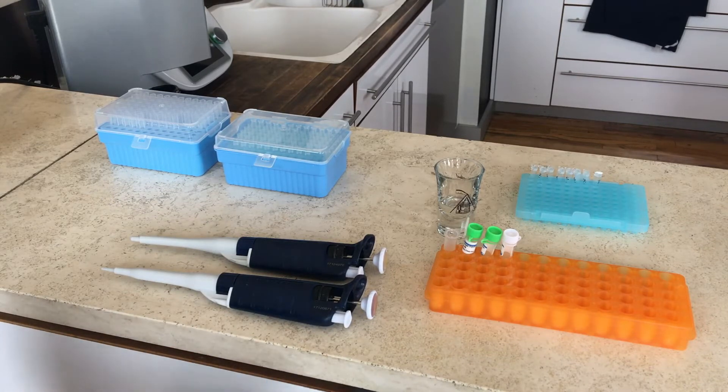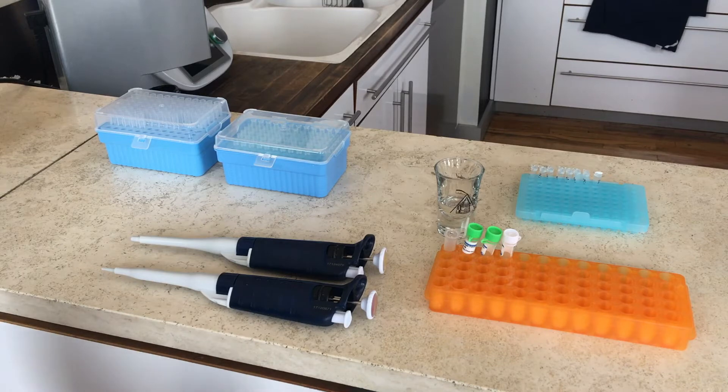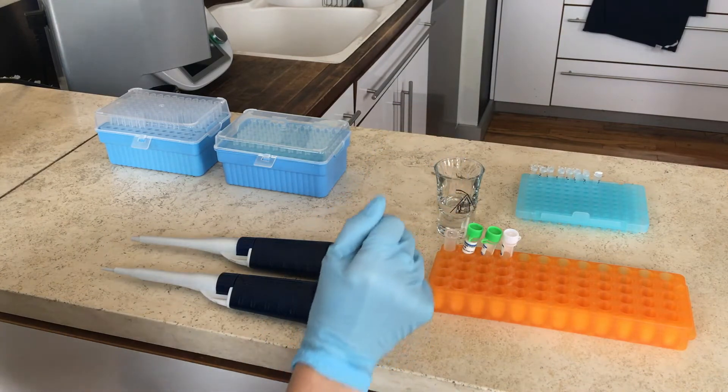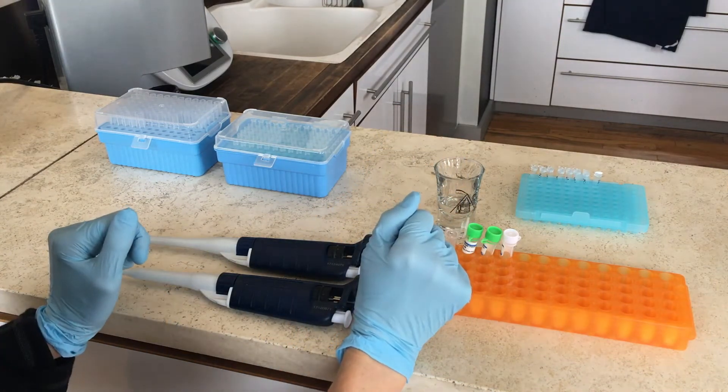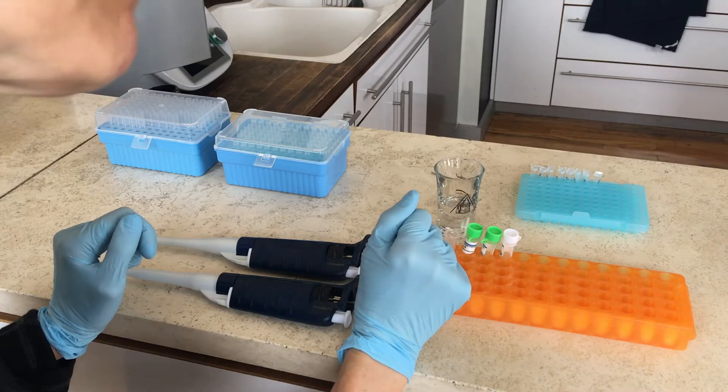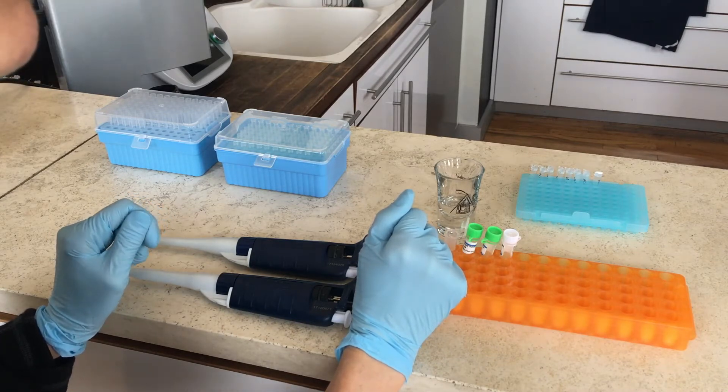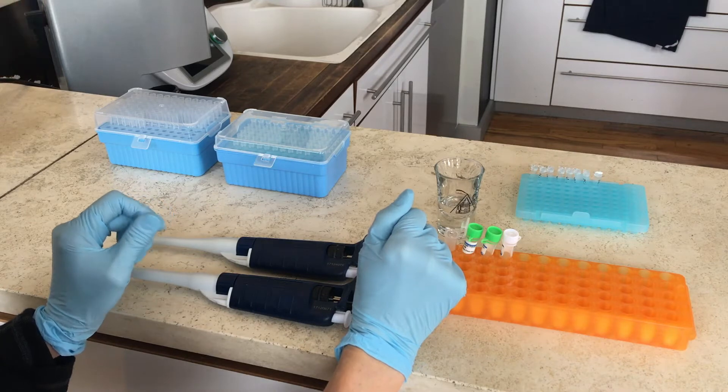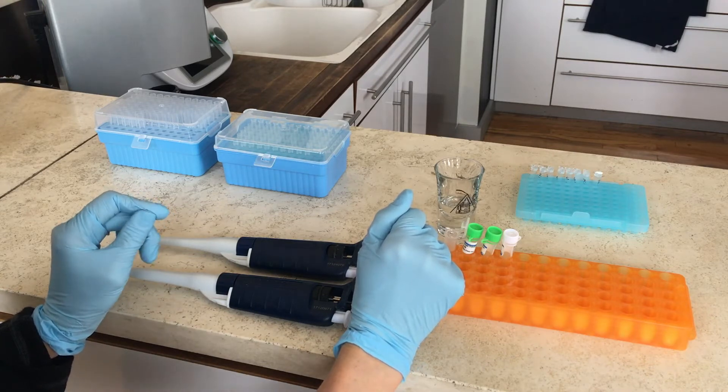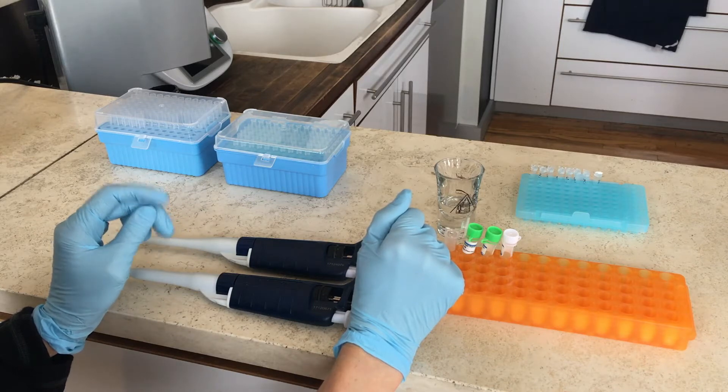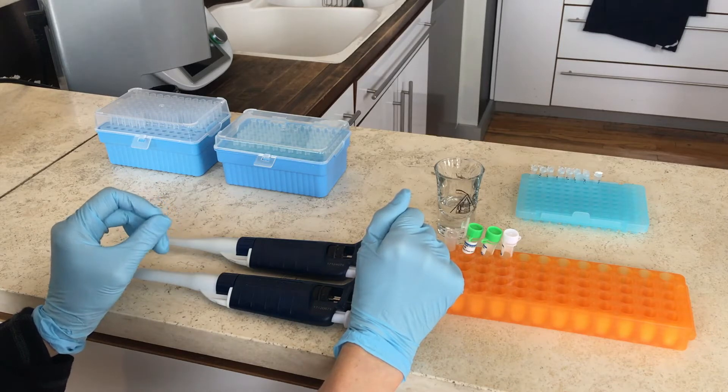So I'm going to put that together. I'm going to measure out about 120 microliters of the PCR master mix, about 5 microliters of the forward primer, 5 microliters of the reverse primer, and then about 100 or so microliters of the distilled water.